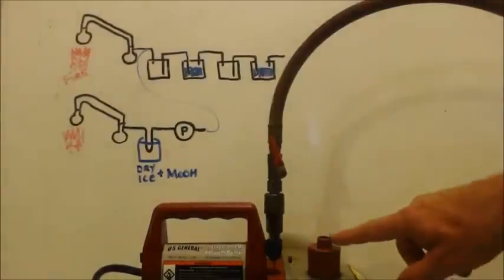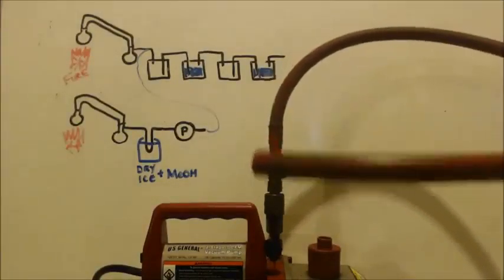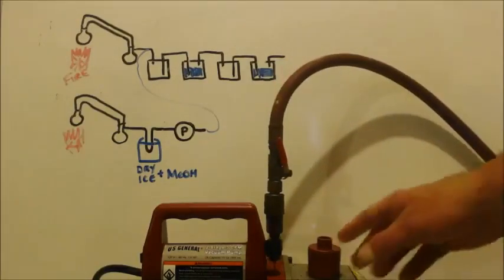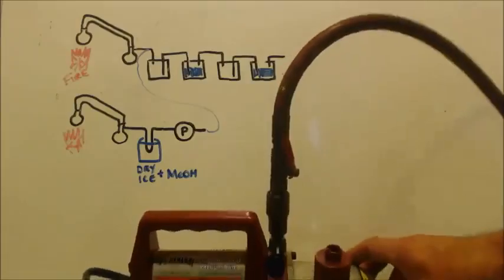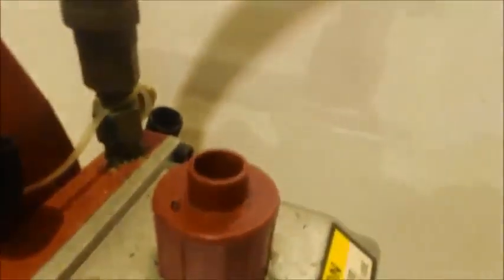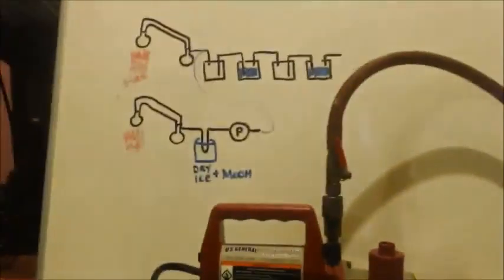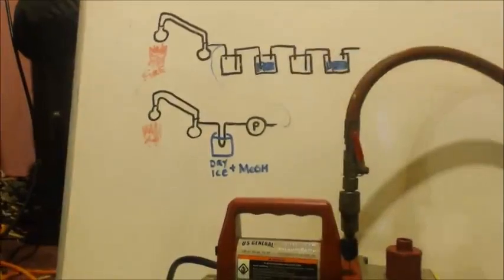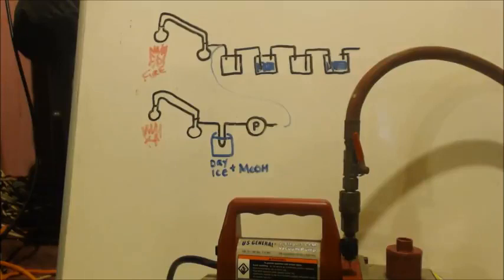So here's my vacuum pump. And you can see this is the outtake, right? This would be the intake. I'd connect this up to my apparatus. It would shoot out stuff here. See how it has like a little iron circle. You can easily put a tube on there. That way when you did this, that's how you get your tube. You take it up to your bubblers or take it to the dry ice, the cold finger or whatever. Just suggestions of what I might do.